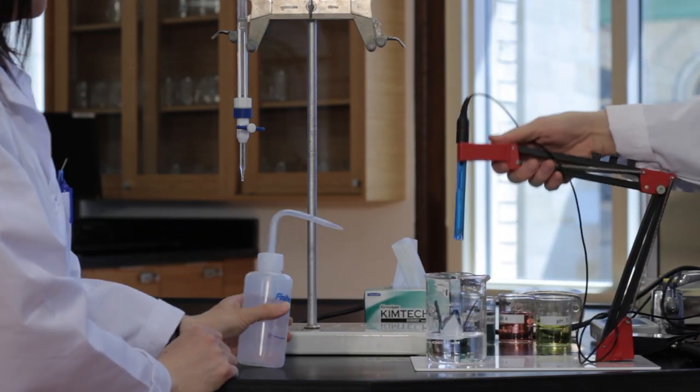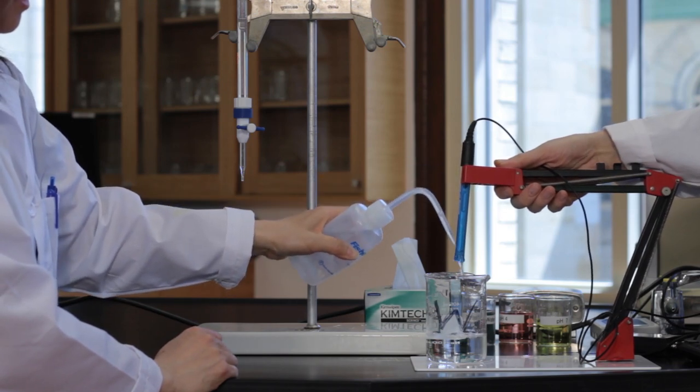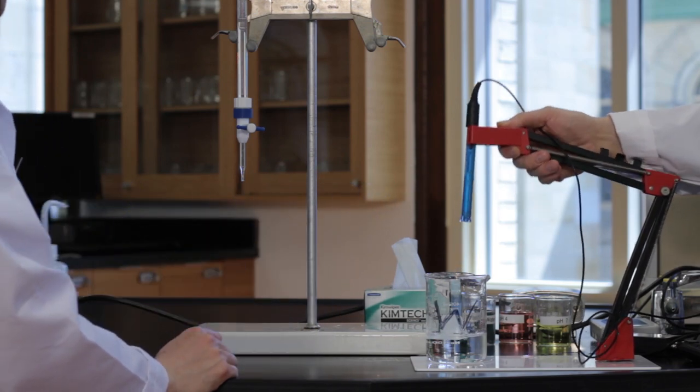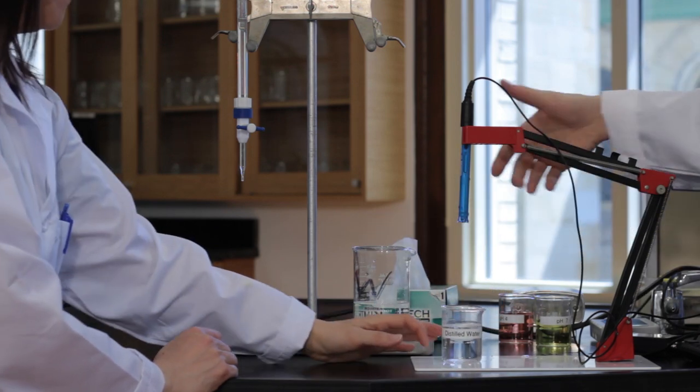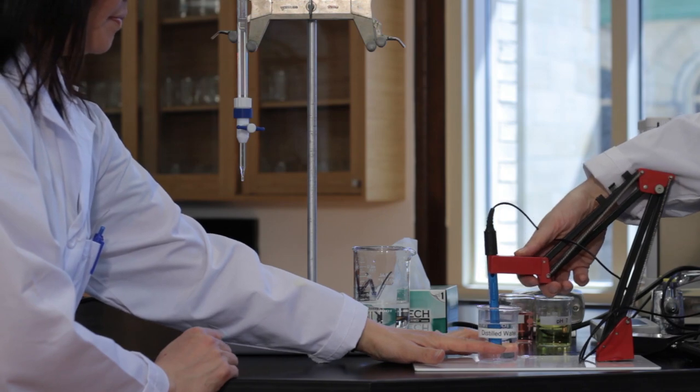Rinse off the pH sensor with distilled water and immerse its tip in the water solution. Repeat the titration by replacing hydrochloric acid with an unknown weak acid. Clean the glassware and put away the equipment.